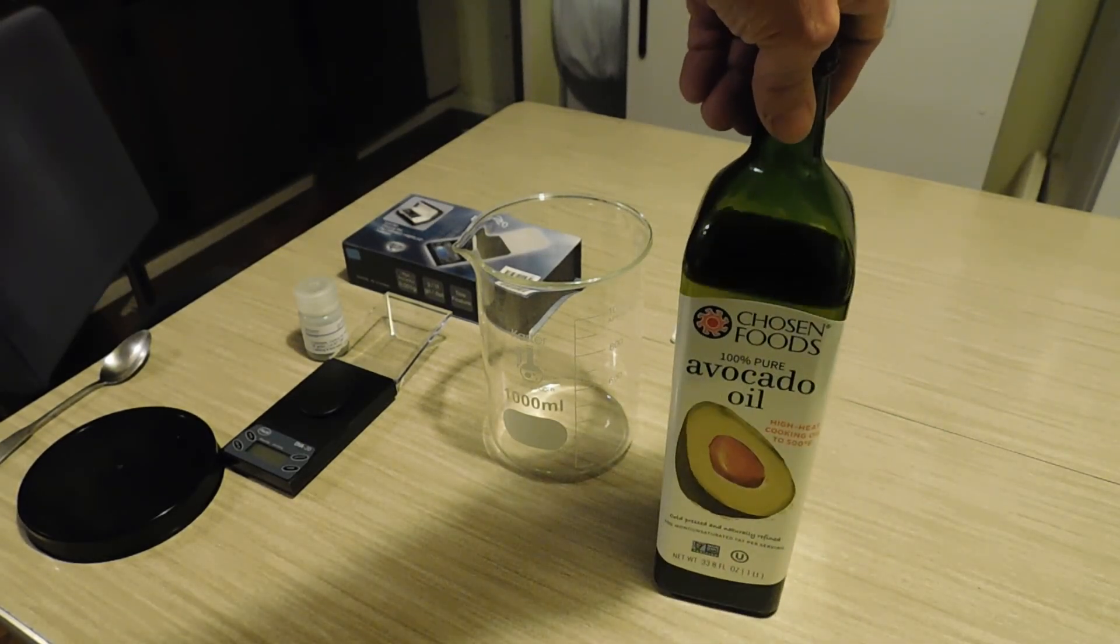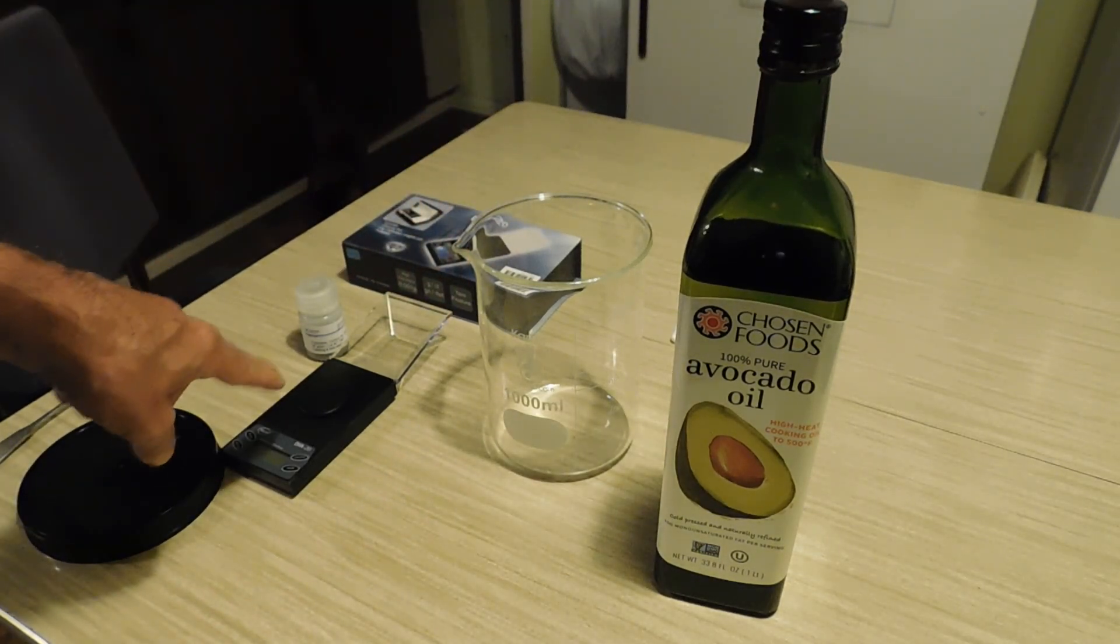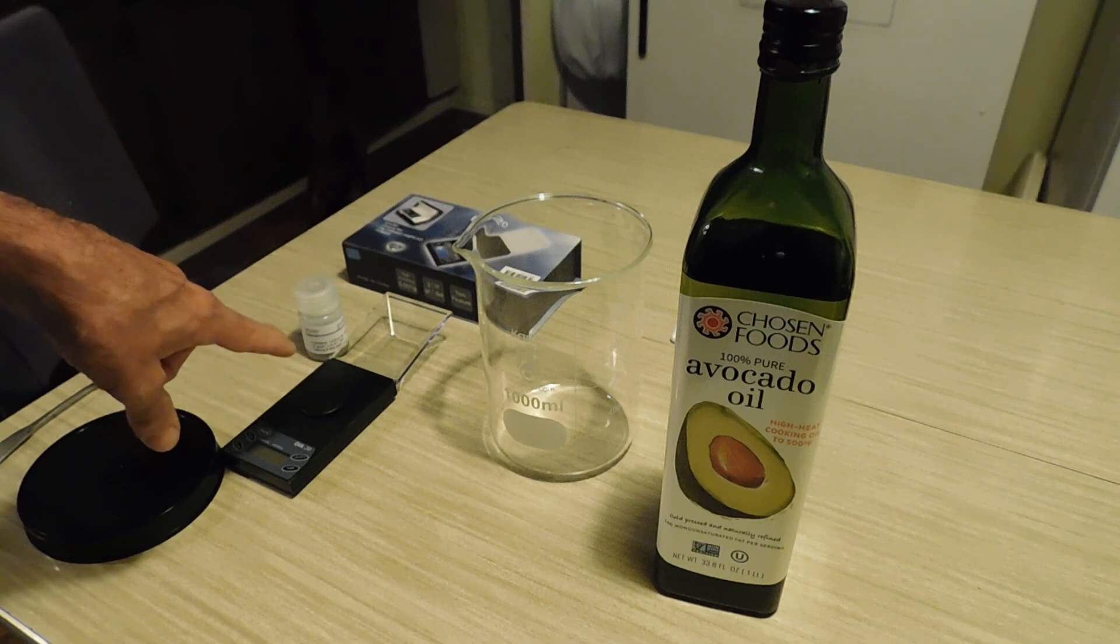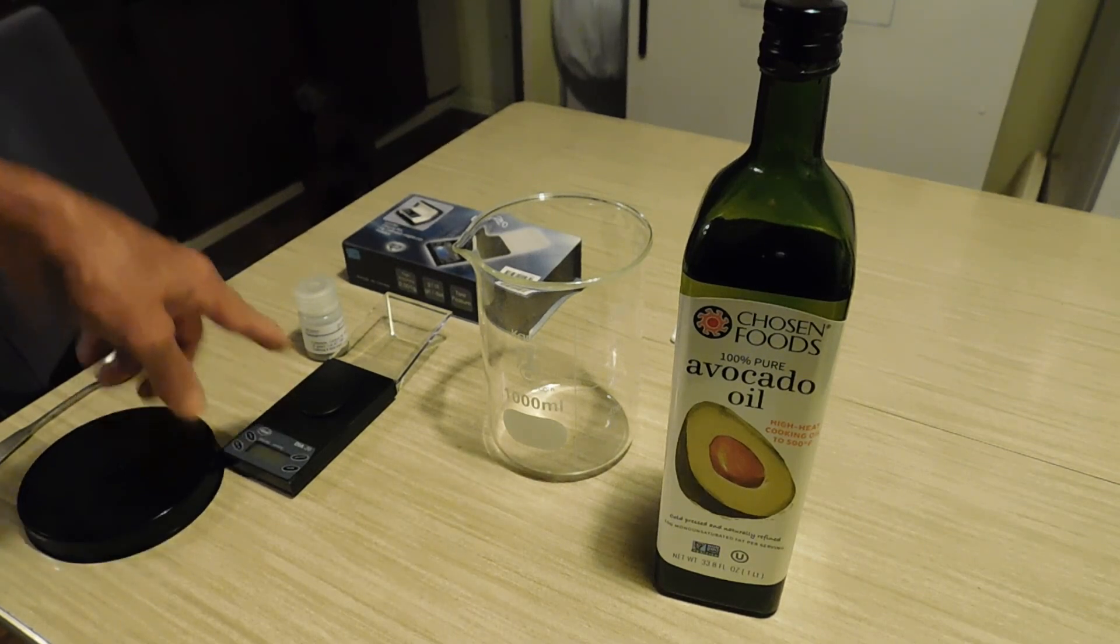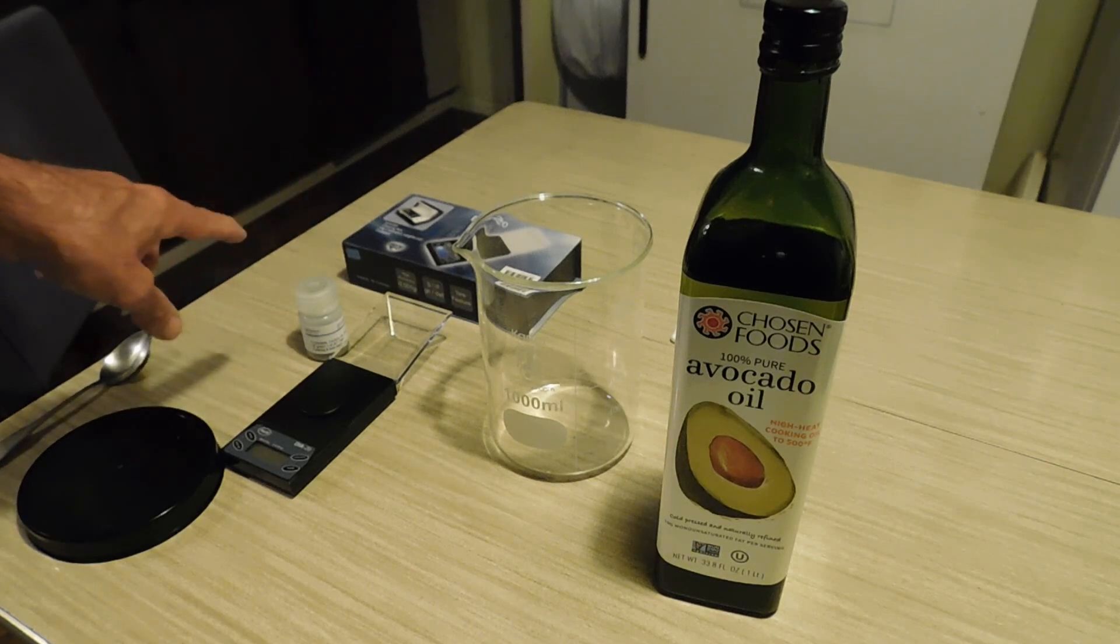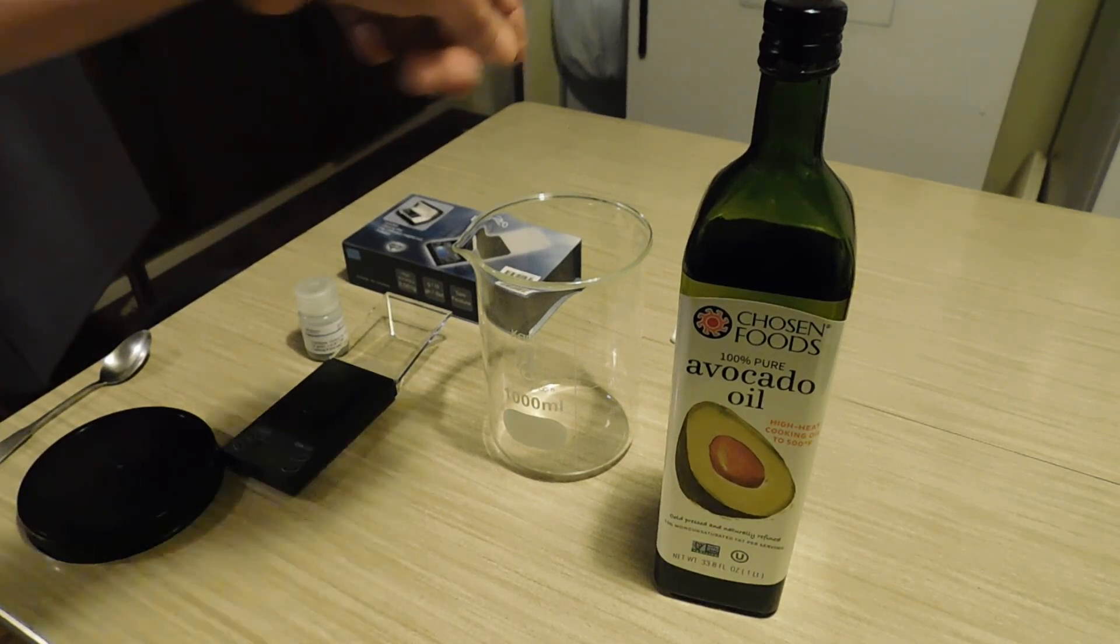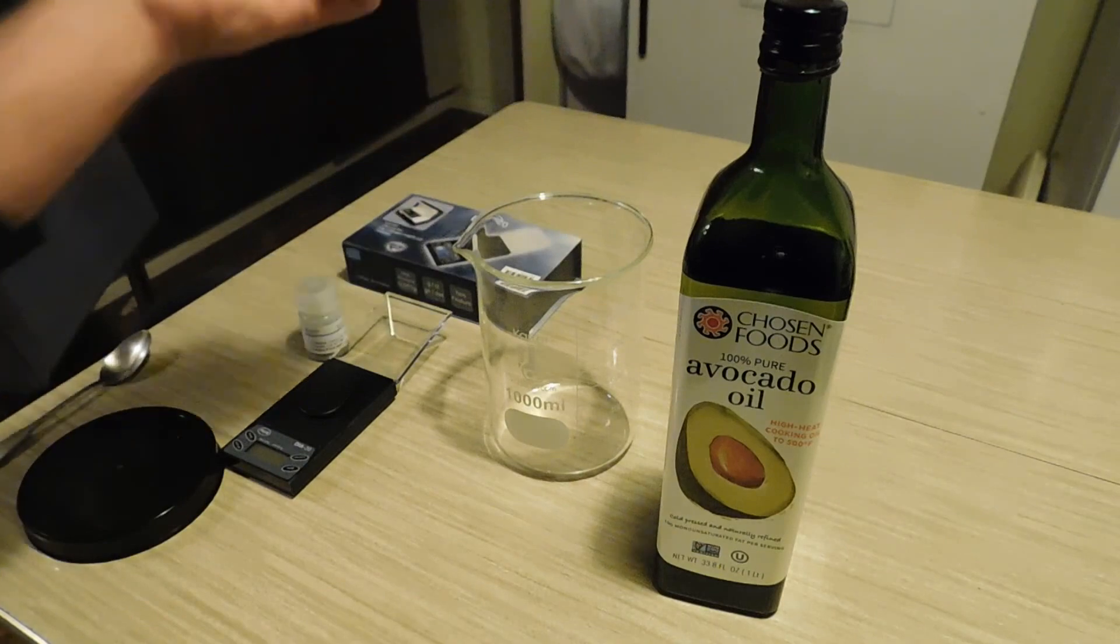You can see the level of oil in there. There's our thousand milliliter stirrer. There's our diamond scale, measures single milligram weights. There's our C60, 95.5, couldn't afford the 99.9%, that's the next batch, the lid, and we'll just go from there. And our little magnetic pill.